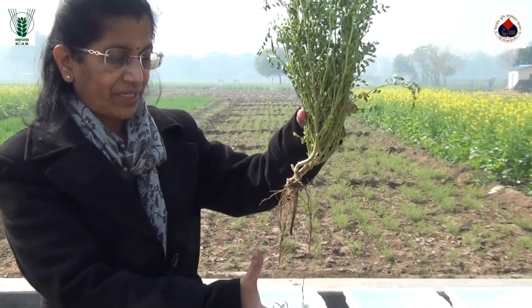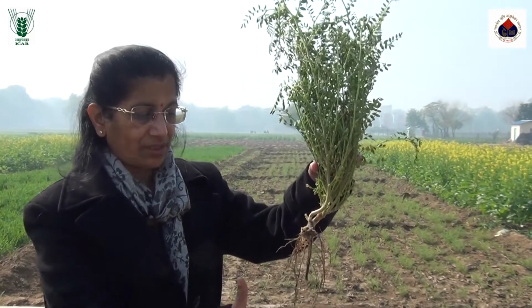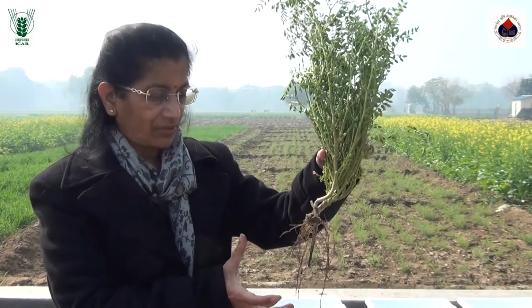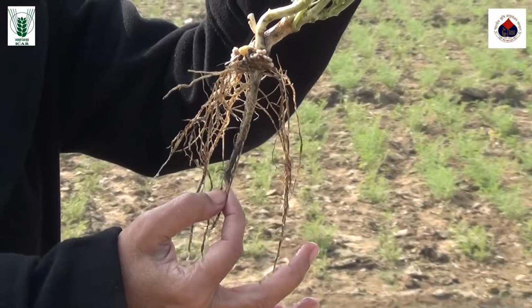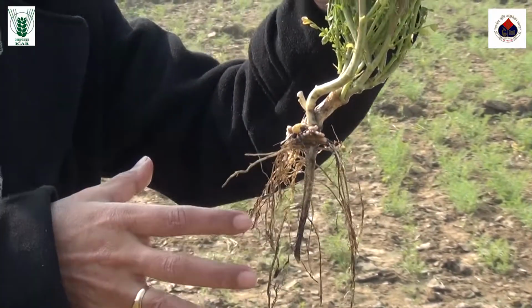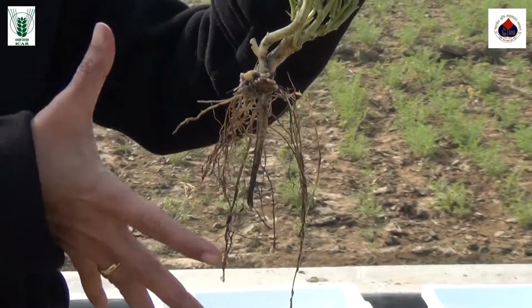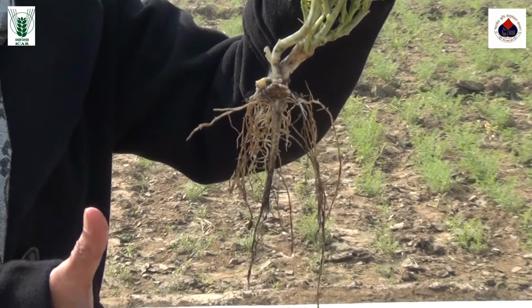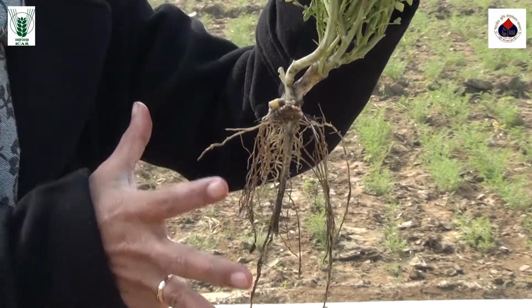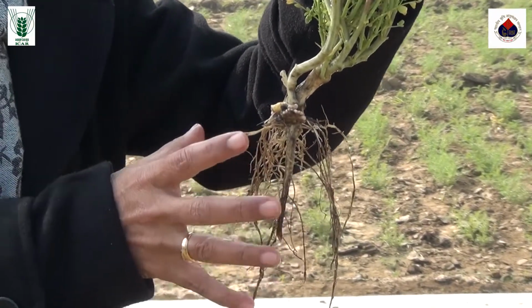So this, like I said, is an inoculated plant. We tried to keep the root portion as intact as possible when uprooting the plant. Even then you can see that there is a breakage of this taproot. If it is an 80 or 85 day old plant, the rooting system must have gone much beyond 15 centimeters, and to uproot a plant with all the roots intact is a difficult process.